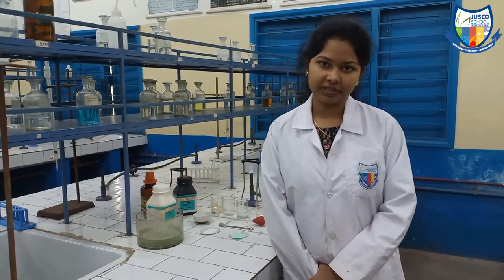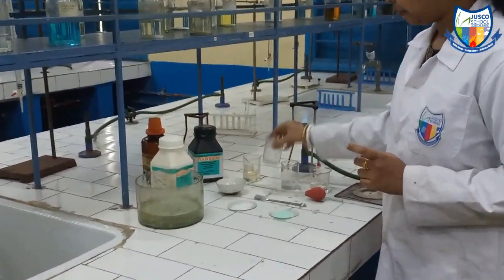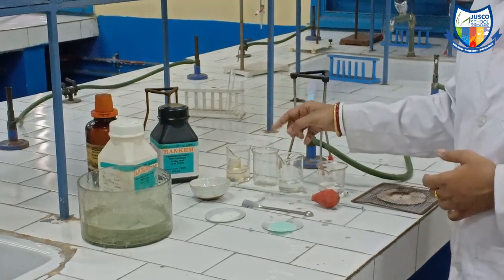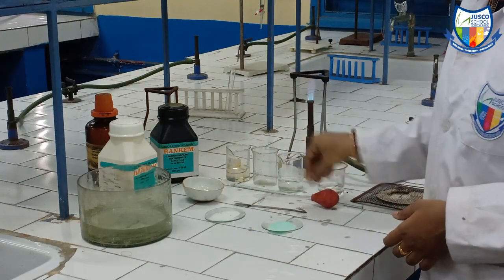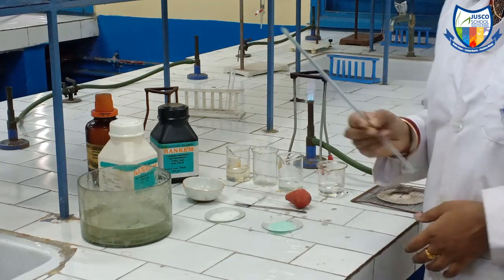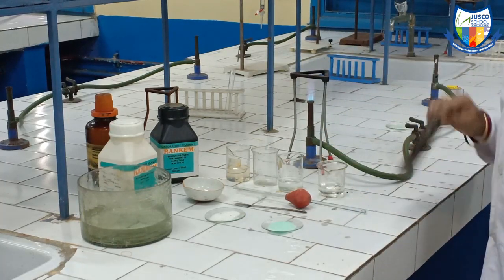We will start by seeing the apparatus — what are the materials required? We will take a beaker; I have taken two beakers mainly for the experiment. We will also take a china dish, a spatula, a dropper, a glass rod, a tripod stand, a burner and a wire.